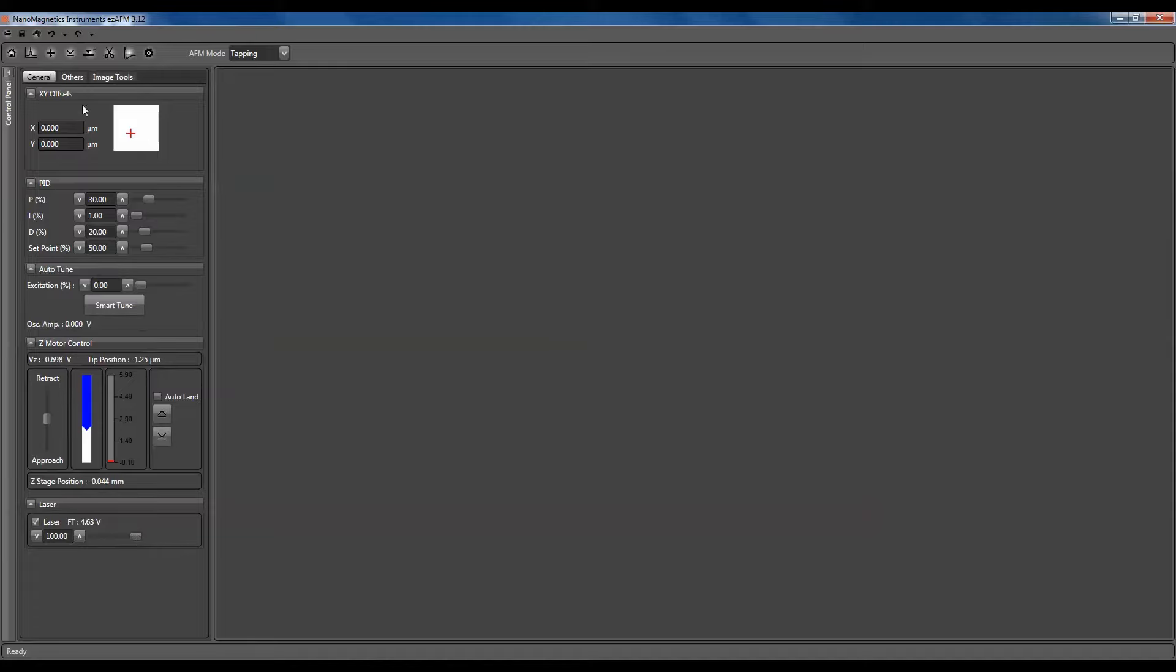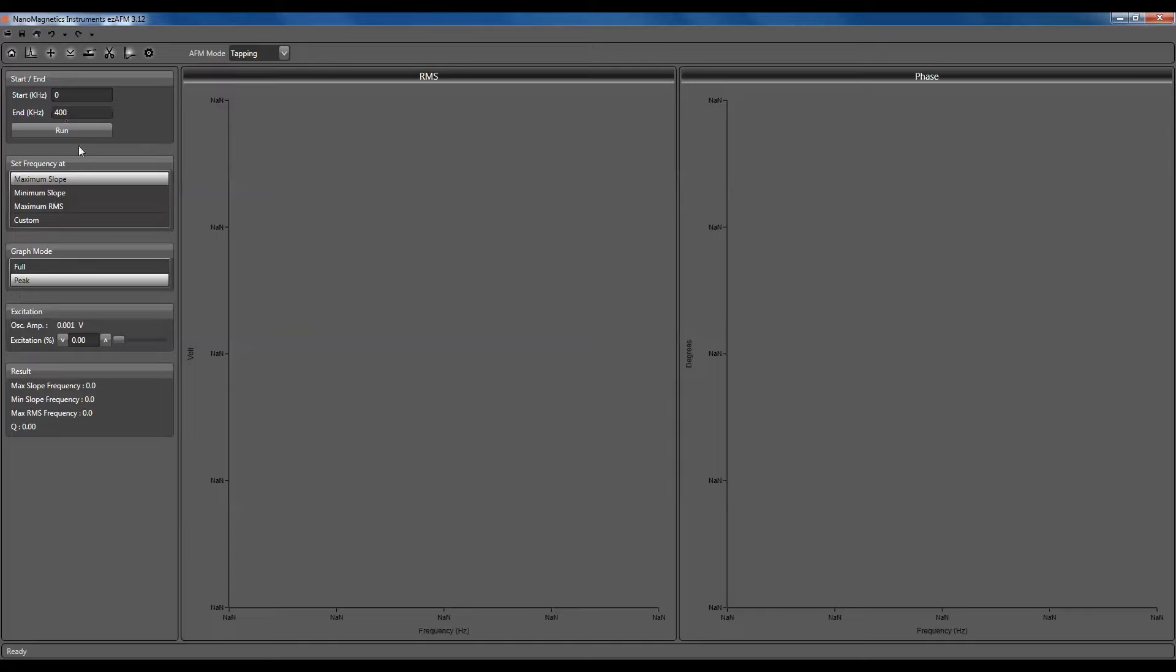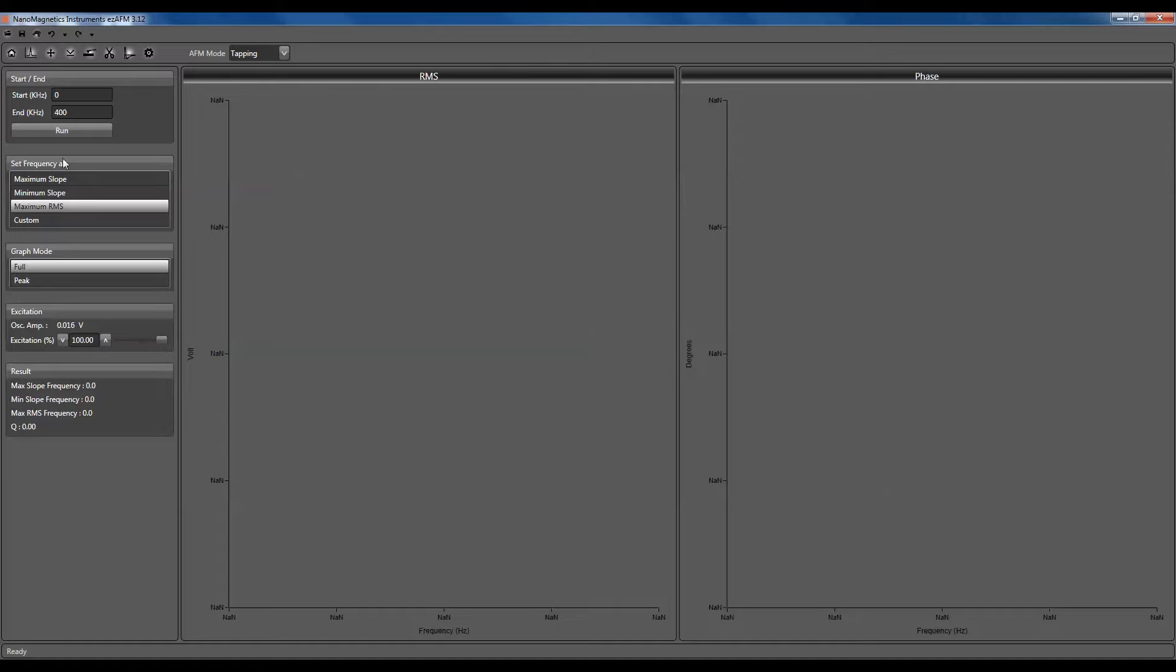Go to the Auto-tune tab. Set the start value 0 and the end value 400 kHz. Switch set frequency at option to maximum RMS and set graph mode to full. Set the oscillation amplitude at 100%.